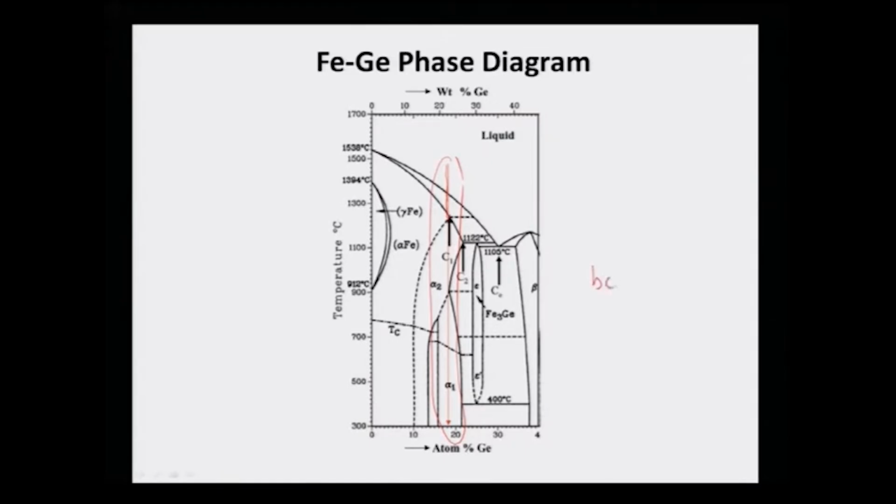So, therefore, BCC alpha iron will become B2, and then further cooling leads to DO3, or that is second order ordering. So, this ordering in the solid state can also lead to stress generation, and that can also cause recrystallization to happen. By knowing that, we are going to see how this EBSD technique can be used to analyze the microstructures. I will show you some microstructures which are basically obtained by conventional optical microscope, and then I will show you some analysis by EBSD.